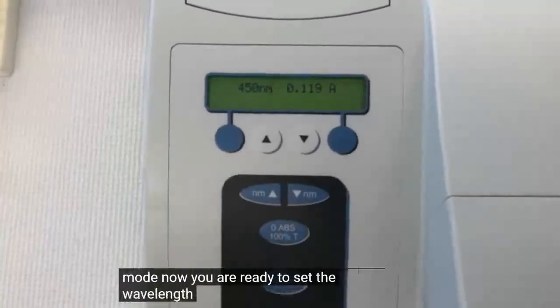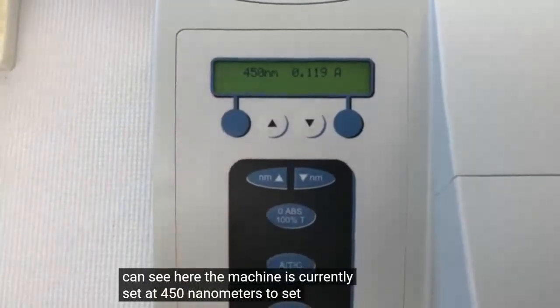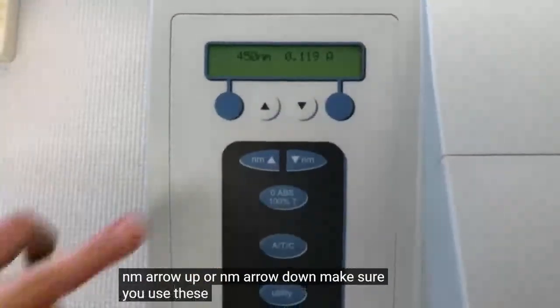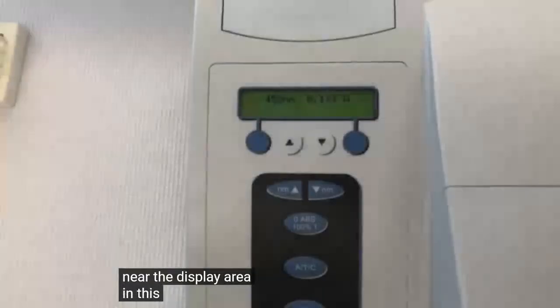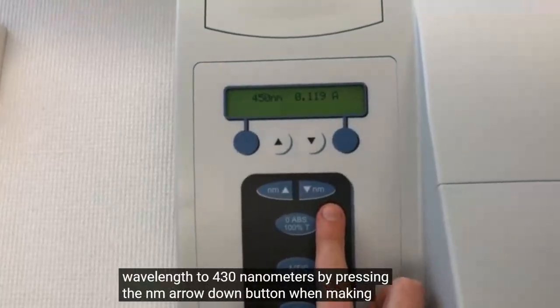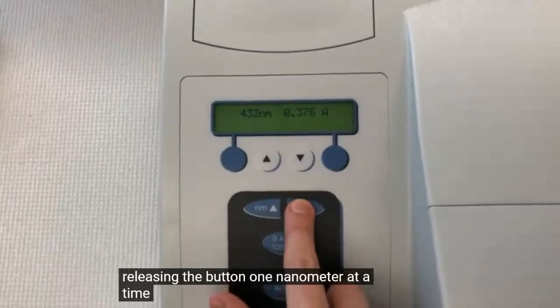Now you are ready to set the wavelength and blank the machine. As you can see here, the machine is currently set at 450 nanometers. To set the wavelength, use the two buttons labeled NM arrow up or NM arrow down. Make sure you use these buttons and not the arrows near the display area. In this demonstration, I will be setting the wavelength to 430 nanometers by pressing the NM arrow down button. When making changes in wavelengths that are far apart, it is better to press and hold the button rather than pressing and releasing the button 1 nanometer at a time.